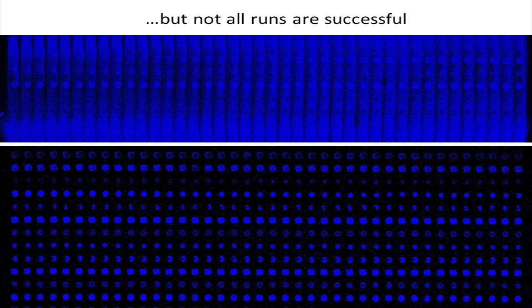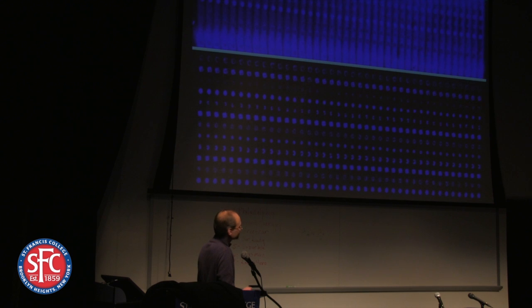I like the way it looks, I think it looks artistic, but it was useless experimentally. Then you go through cycles of trial and error, using different solvent buffers, combinations of water with various organic solvents, ionic strengths and pHs, and figure out how to do this well. These are pictures of printed supports that the students have prepared in the lab.